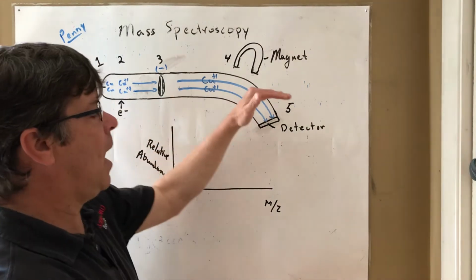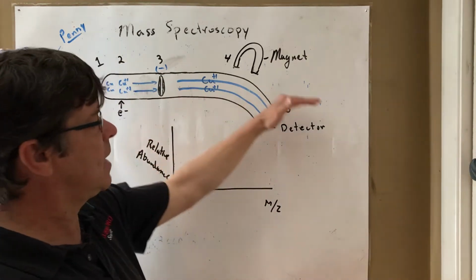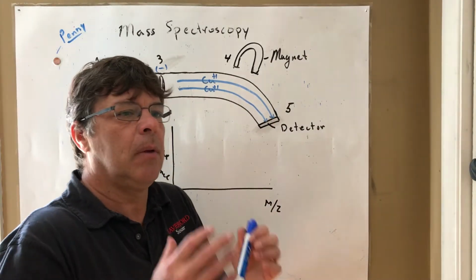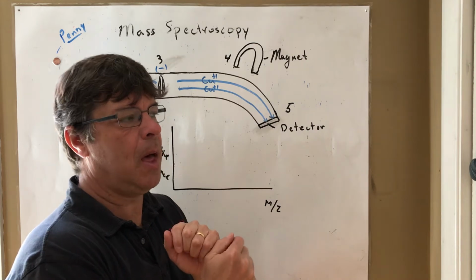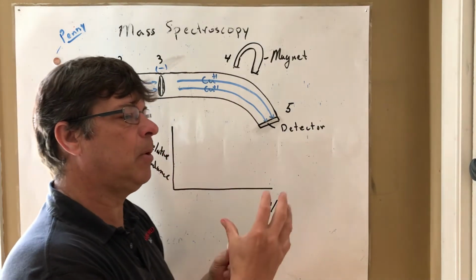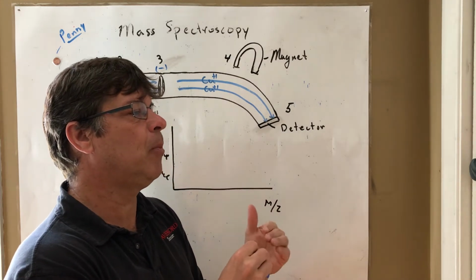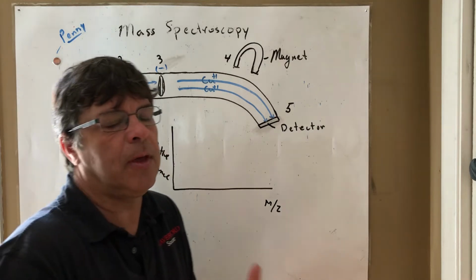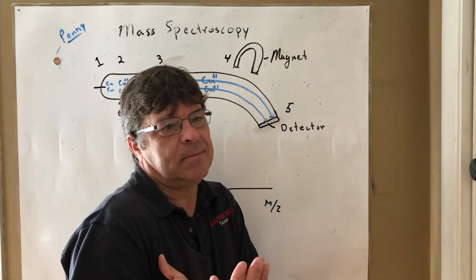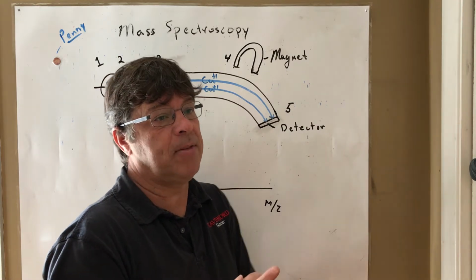So these copper ions, they're going pretty fast. They're going with a constant velocity. Inertia just says they just want to keep going in a straight line. The magnetic field is able to deflect them. Why would one get deflected more than the other? Well, it has to do with 2 things. Mass, and they're going the same speed, so momentum.